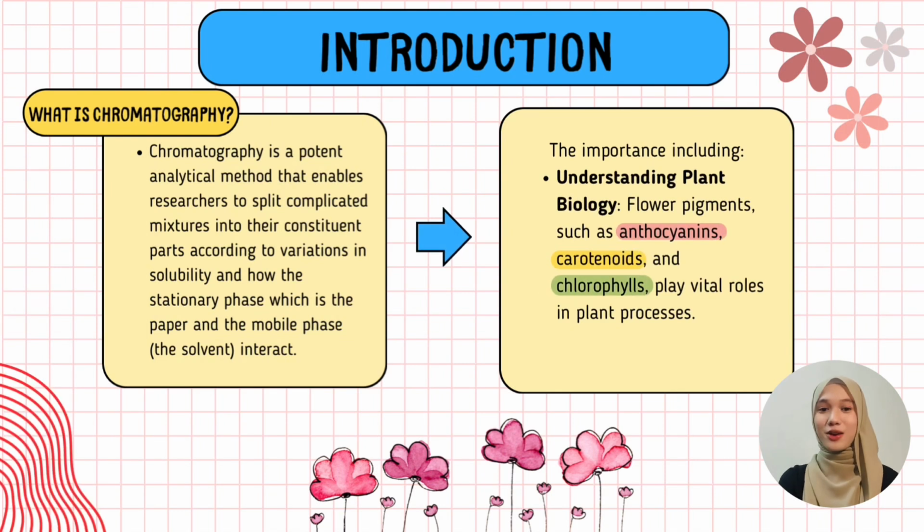Hi, my name is Amira Auni. So I'm going to share with you guys what is the definition of chromatography. Chromatography is a potent analytical method that enables researchers to split complicated mixtures into their constituent parts according to variation in solubility and how the stationary phase, which is the paper, and the mobile phase, the solvent, interact.